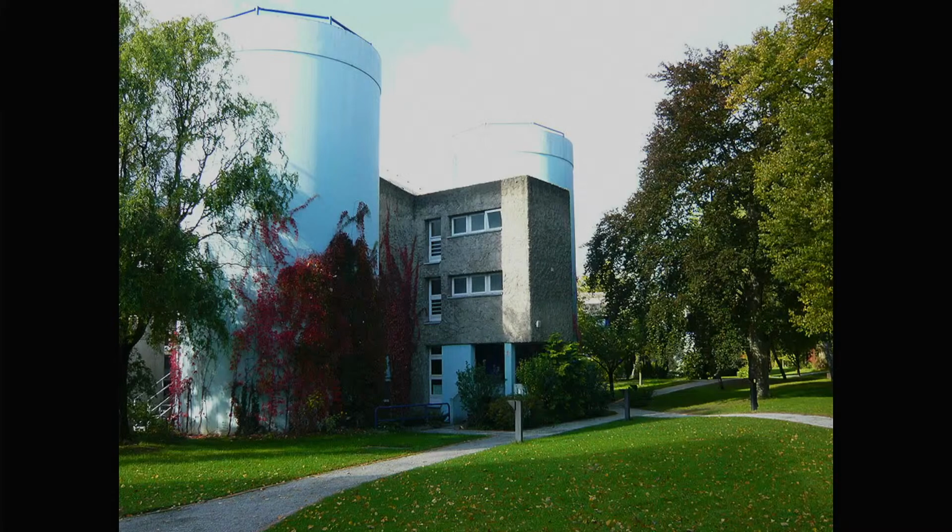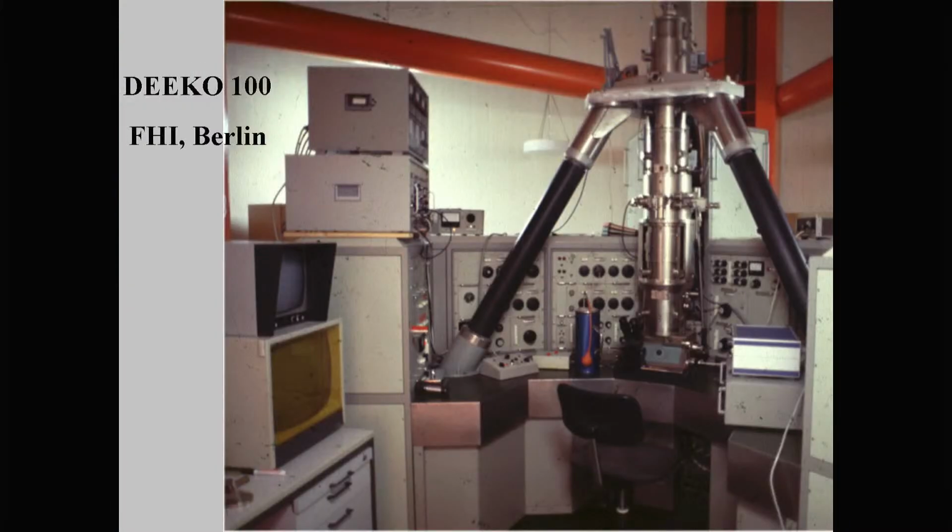He built these instruments, the first high resolution instruments, in an academic environment, and then later the industry kicked in, and Thermo Fisher can do it much better than these first experiments. Here you had these towers. The outer tower was only to prevent the wind from hitting the inner tower, so that you wouldn't shake. And the underground passing by wouldn't also cause vibrations. And from the inner tower was suspended a cage, this orange thing here, and there on a platform was the instrument.